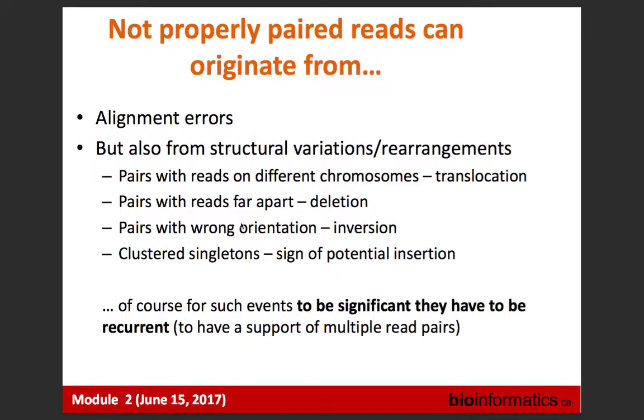That's essentially what I just said. It could be a deletion, inversion, or insertion, and these will all result in non-properly paired reads. And the last class of non-properly paired reads, in a paired experiment, is when one read is aligned and the second is not aligned. Again, there can be many reasons for those, but you will have this class. Typically for ChIP-seq, we ignore those, but if there are very, very many of those, you can consider keeping them and think about how to extend those reads.